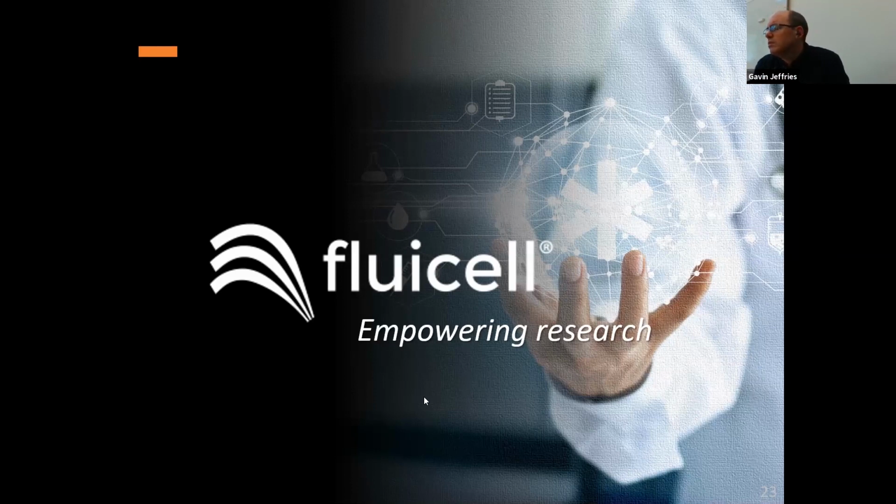Thank you. We have a couple more questions from Yuha, who asked, the first one is, can you give an indication of how many cells are required for printing? Is it millions of cells, or something similar? So in general, we've had very successful printing runs on very small numbers of cells. If you look at our most basic model, it's like a single square of hepatocytes, for example. So it's like a 500 micron square.